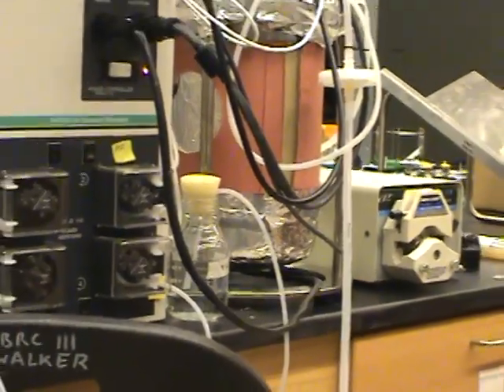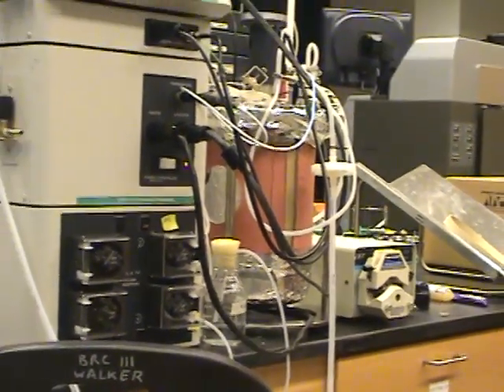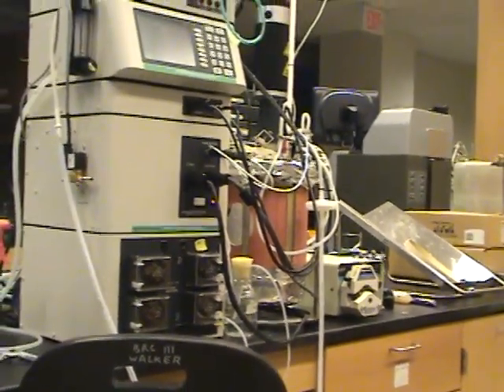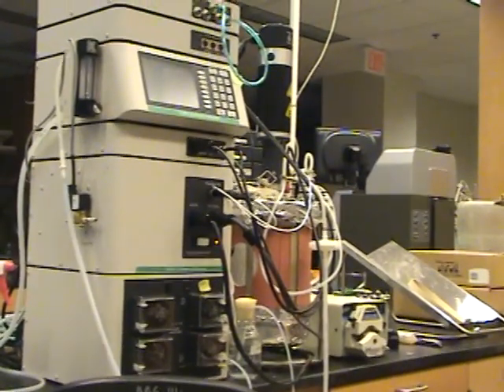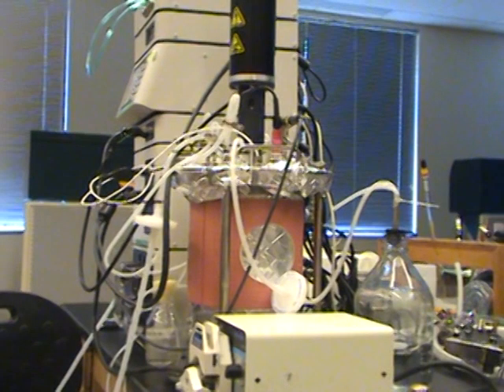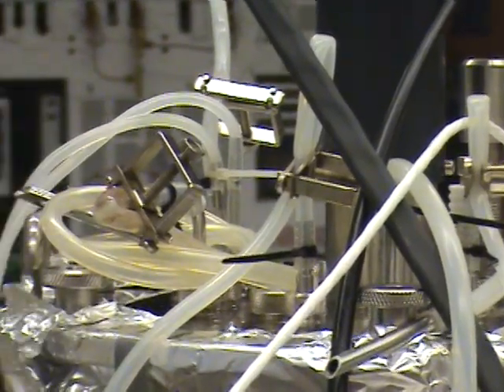The bioreactor is assembled and covered with foil to keep out light. The tubes are removed and the whole system is autoclaved or sterilized at 121 degrees Celsius. After autoclaving, the probes are reattached and the agitator is reassembled.